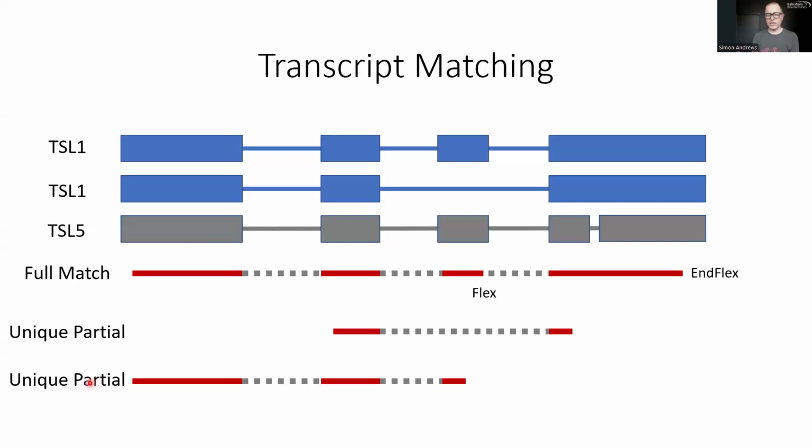So those are the three classifications we can have, depending on the extent of the reads and the structures of the isoforms that we retain in the analysis. We can either take each read and map it as a full and complete match to a single isoform, as a partial but unique match to one isoform, or as a match which is compatible with the collection of isoforms, but we can't tie down to a single one, in which case it's just a gene level match, okay? And we count those matches up and we report all of those matches in separate count tables. So in your downstream analysis, you can choose the degree of resolution with which you want to work.